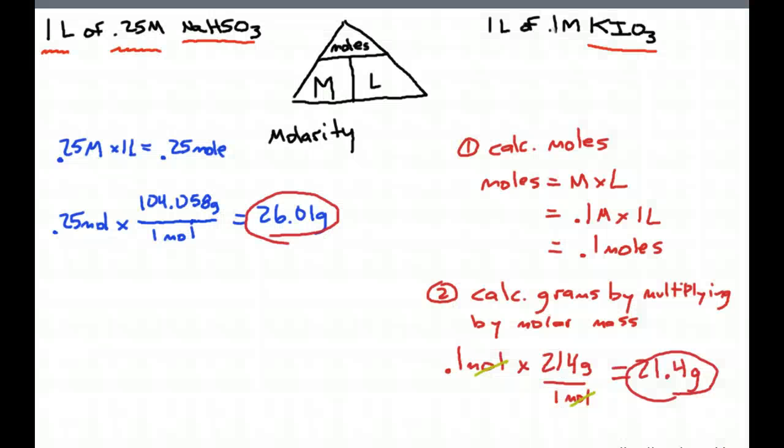That's another variation of the iodine clock. Again, just diluting these solutions way down to a much lower concentration just makes them slow way down. I mean, that just makes sense. If you decrease the concentration, you slow a reaction down. That brings back some information from last semester, actually. All right, so there you go.